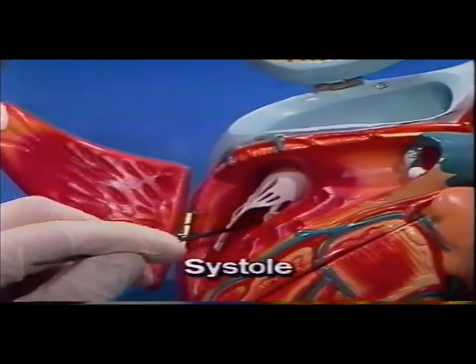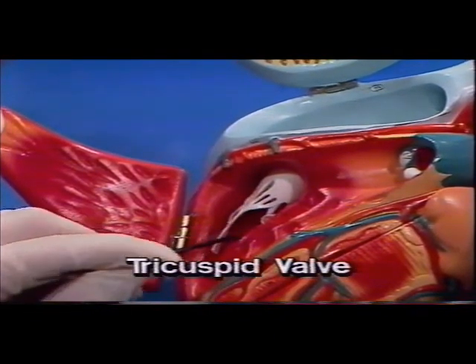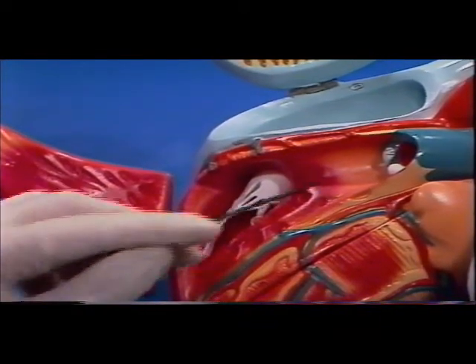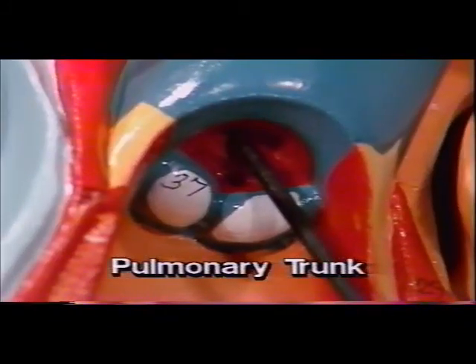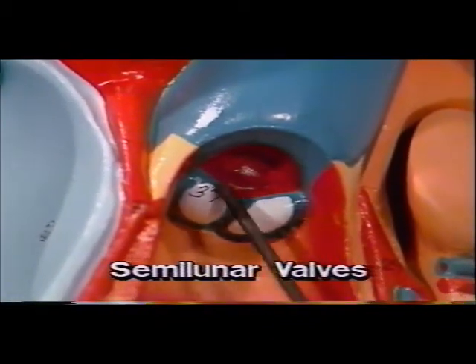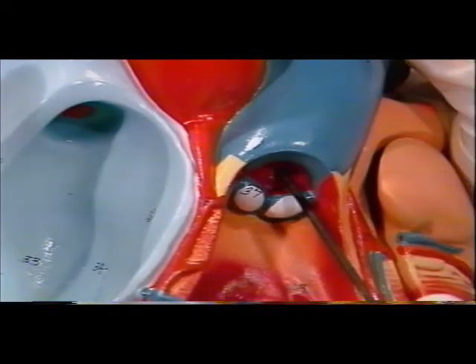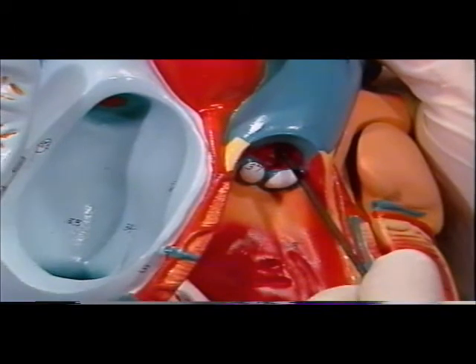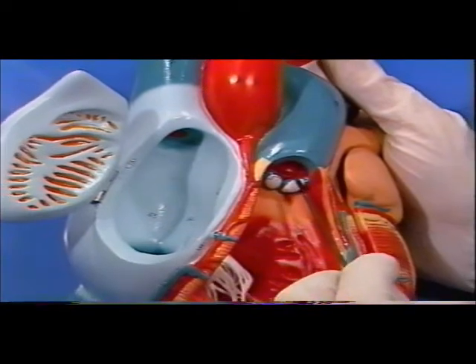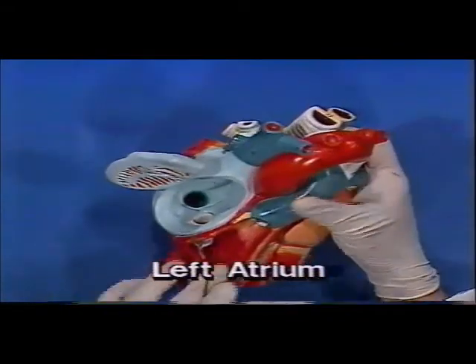When the heart contracts in systole, this blood rushes against the tricuspid valve and closes it. The blood then must choose the path of least resistance, the pulmonary trunk. The valve of the pulmonary trunk, one of the semilunar valves, keeps blood from rushing back into the heart. The blood in the pulmonary trunk flows into the circulation of the lungs, where it is oxygenated. This oxygen-laden blood flows by way of the pulmonary veins into the left atrium.